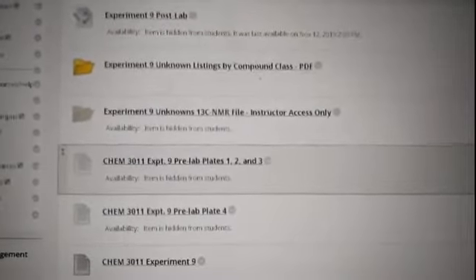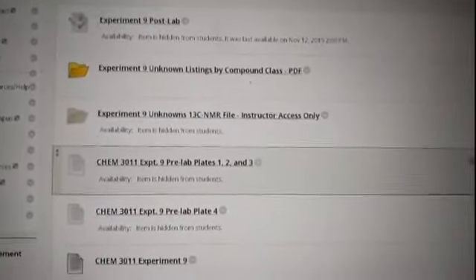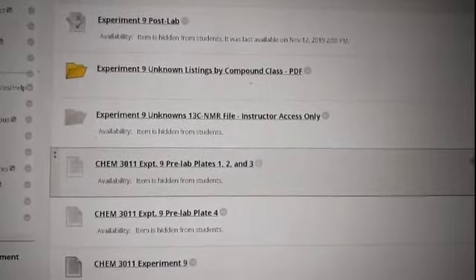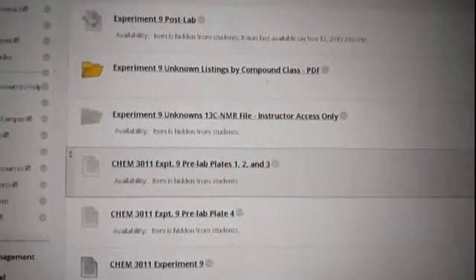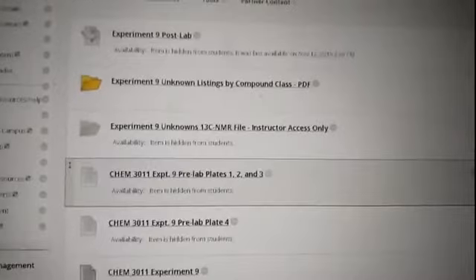So far, we're pretty sure we have 7 aromatic protons and 1 proton from an alcohol. Our solubility class says we have a phenol, and our carbon NMR suggests 10 carbons if there aren't any equivalent carbons. So we're pretty sure we're in that ballpark at least.